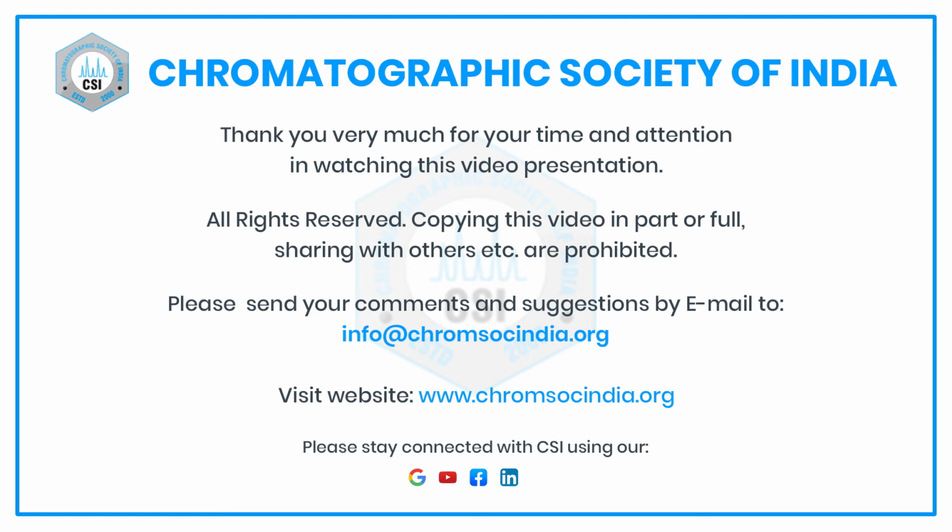Formation of an ion is not a challenge in GCMS. In GCMS, you can blindly send the compound into the ion source and impinge electrons on it. So anybody without much experience can do a GCMS. But when you are doing an LCMS, you have to really understand what your molecule is, what methodology you want to choose, and how you can ionize it. So do not, when you have a protein, peptide or an enzyme, say, oh, I have got APCI, let me do APCI. Wrong decision. So I am requesting all of you, please look at the sample.